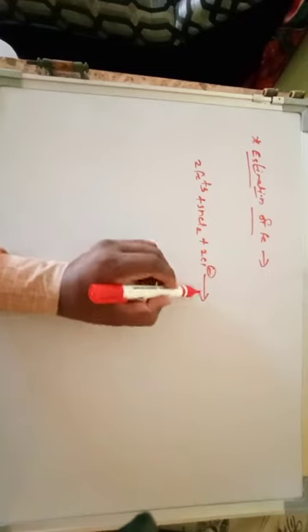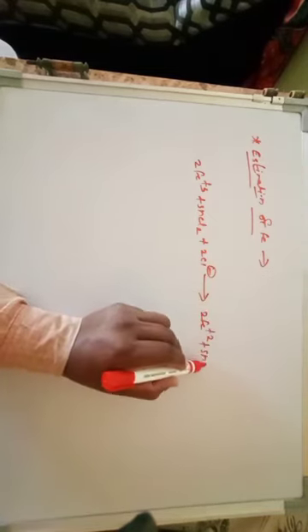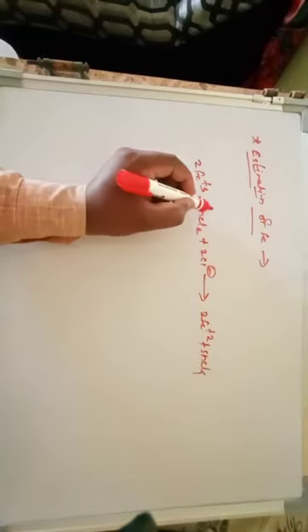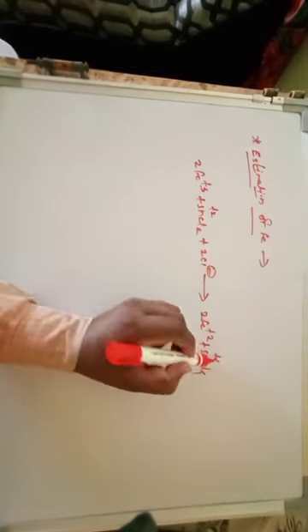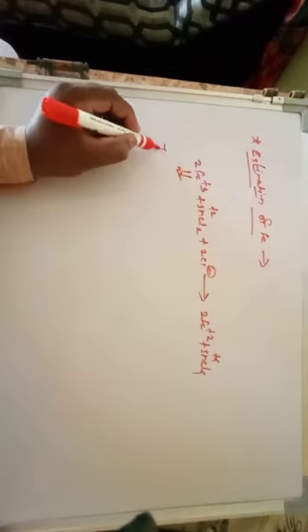Therefore the tin chloride acts as a reducing agent. It will reduce Fe+3 into Fe+2, and there is oxidation of tin from the +2 oxidation state to the +4 oxidation state. The reaction is complete when the yellow color of the ferric chloride complex disappears. This Fe present in your solution is yellow in color.